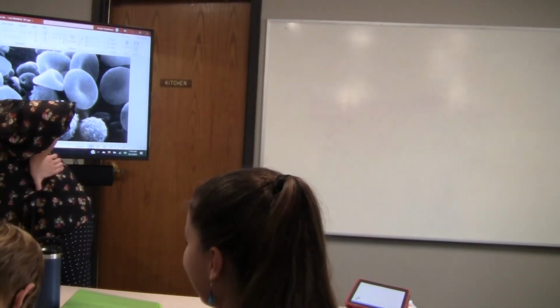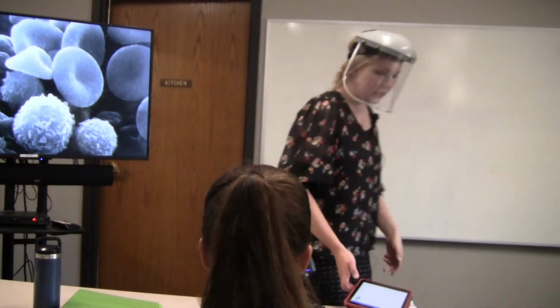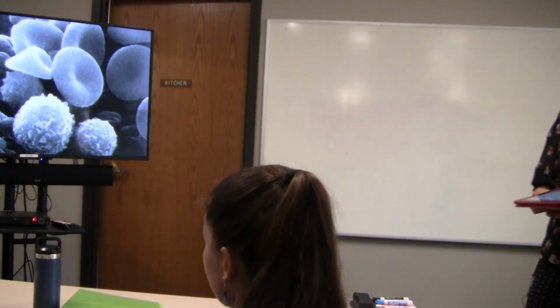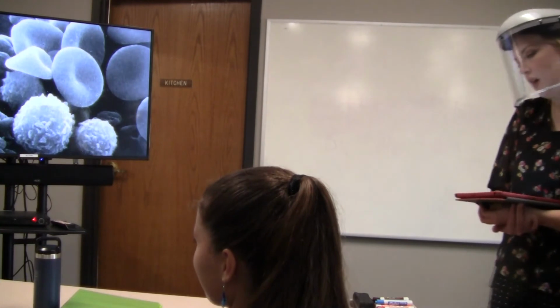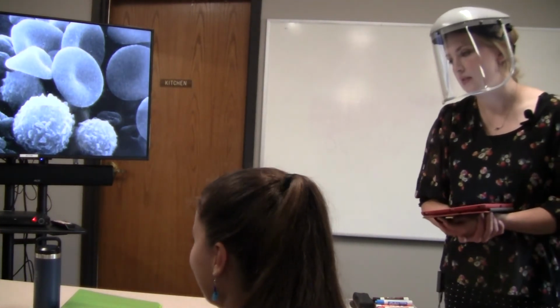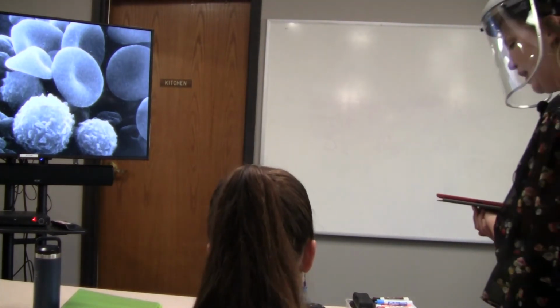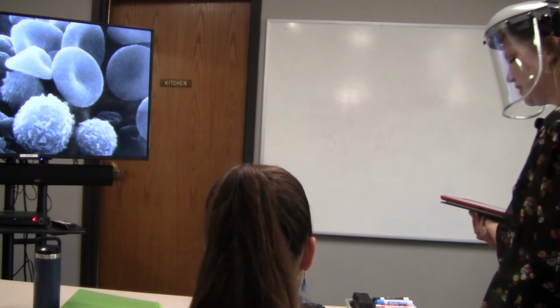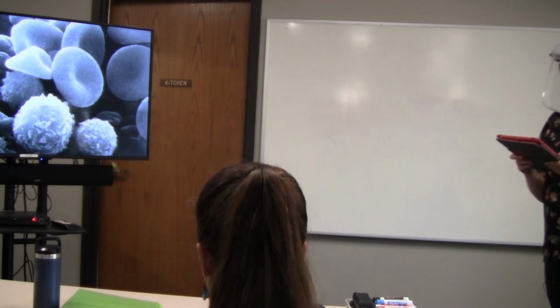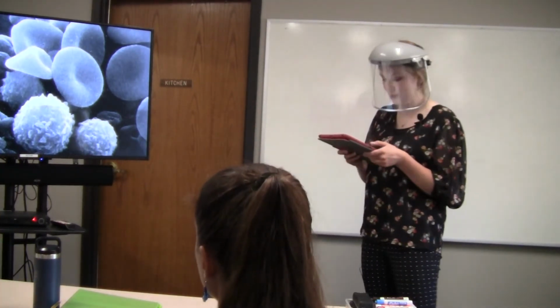Okay, so let's take out those sheets. We're going to go through and define these terms, the different parts of the microscope. Starting with: it's located on the side of the frame, used to adjust the focus of the microscope. This is the adjustment knob. So if you didn't already put that in, it is the adjustment knob.